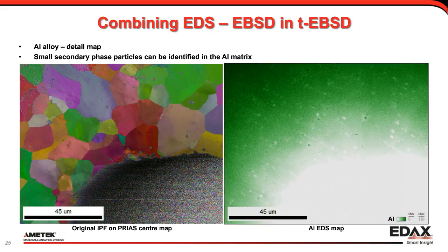When you zoom into a section at the top left of the sample, small particles that did not index properly become visible in the IPF map. The intensity in the simultaneously collected aluminium EDS map strongly changes with the specimen thickness, but the sample here also clearly is not homogeneous. The location of small particles can be seen by the reduction of the matrix aluminium signal.